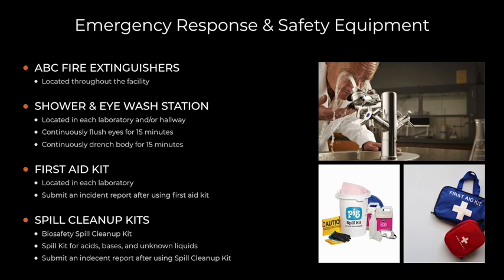By familiarizing ourselves with the location and proper use of emergency response and safety equipment, we can help to ensure the safety of everyone in the facility.